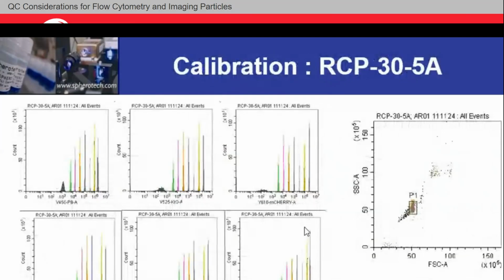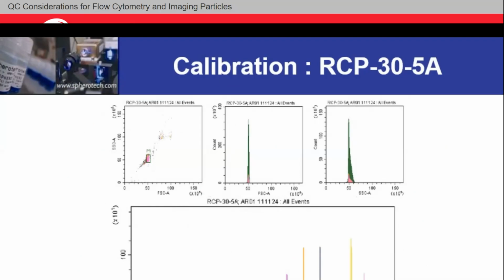But this begs the question, why do we need calibration particles? Well, we want to make sure that they're linearized, right? This is a logarithmic scale here. In fact, it's exponential data. We always use the term log because log is how you undo exponential data to make it into a line. We're always trying to make it y equals mx plus b, something that our minds understand. And we can say with confidence, if we put a trend line on top of that, do we have confidence therein, right? And that's what we really want.